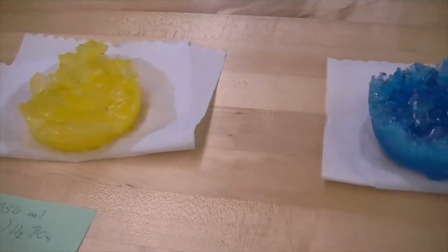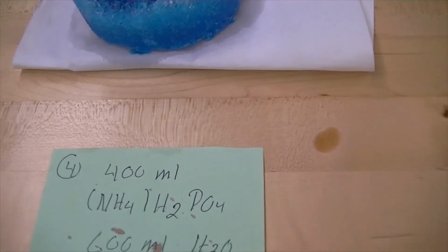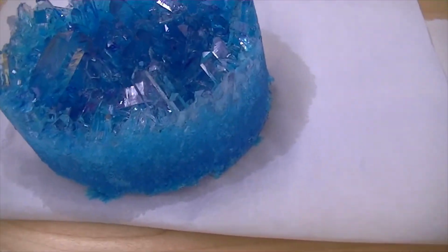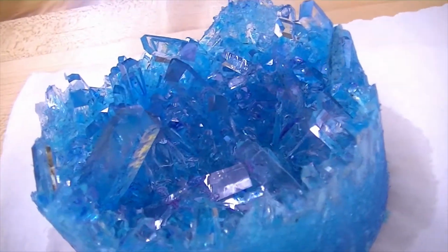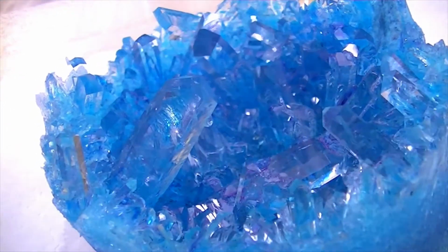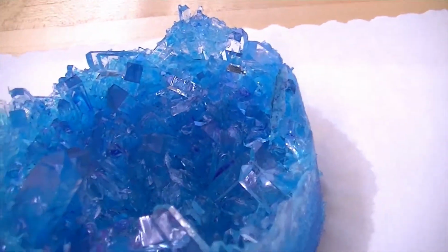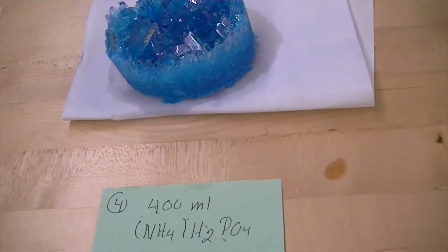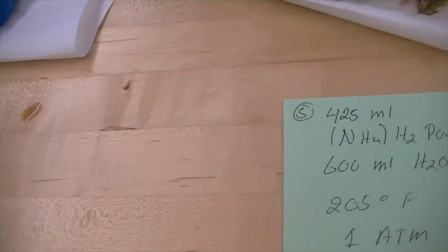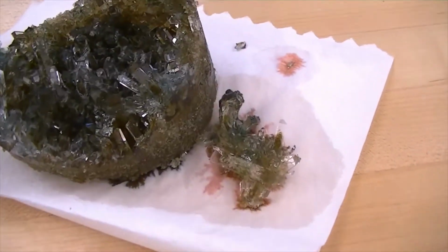Sample number 4 has 400 milliliters. And the last sample, number 5, has the highest concentration at 425 milliliters. And these are the crystals that grew.